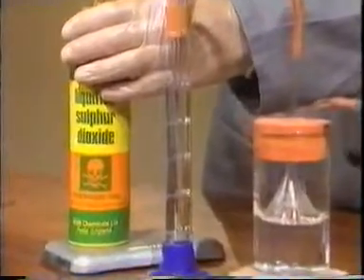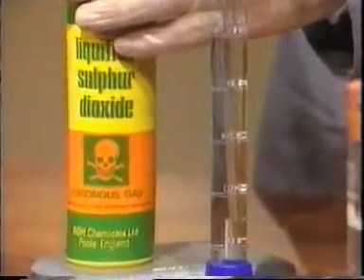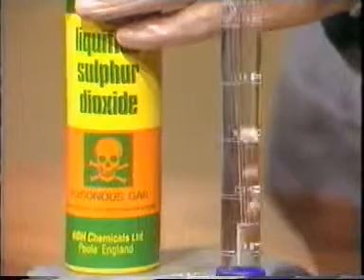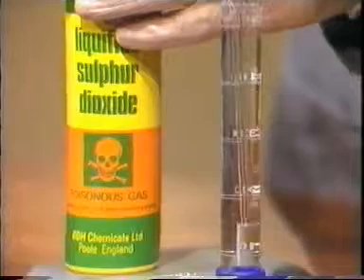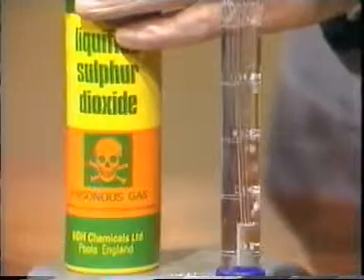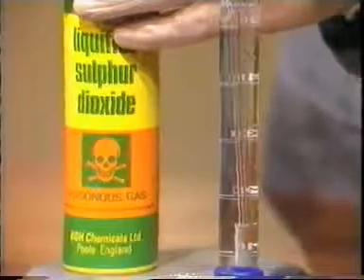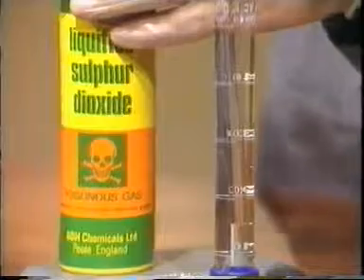When I open the valve from the sulfur dioxide cylinder, we shall first get a few bubbles of air from the tubing, and they come up to the top. But now we're getting sulfur dioxide, and you can see the bubbles getting smaller as they go up the cylinder, confirming that sulfur dioxide is soluble in hexane.